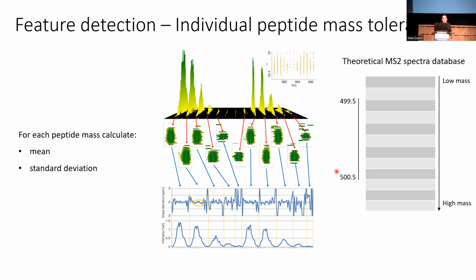You remember that I was talking that we go from the very big list of the peptides after we digest them in silico from the FASTA file to a very small list that we actually do the comparisons and the Andromeda scoring. And how do we do that? For each one of the peptides, for your experimental spectra, you know the precursor mass, actually also from here, so you will use these two numbers.